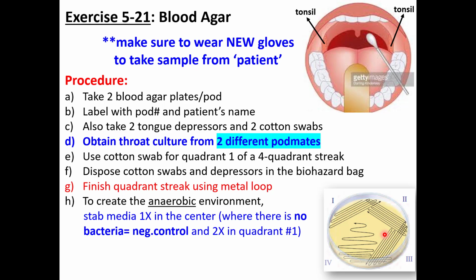Instead of being all the way on the surface, we could create a deeper environment, and deeper in the agar you'll be low in oxygen.